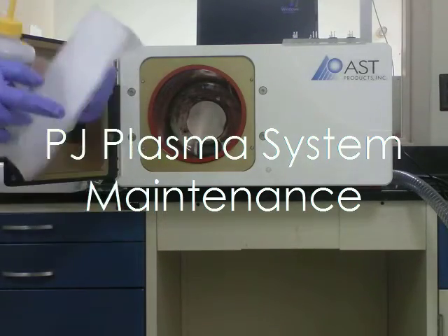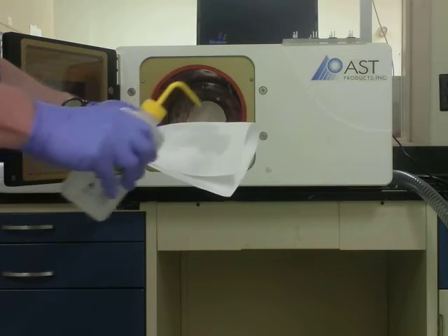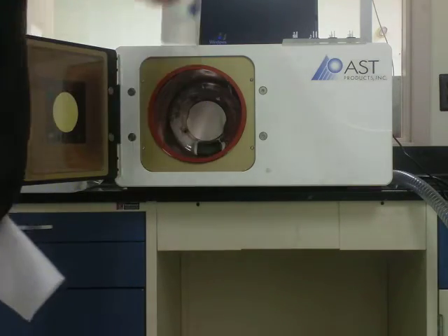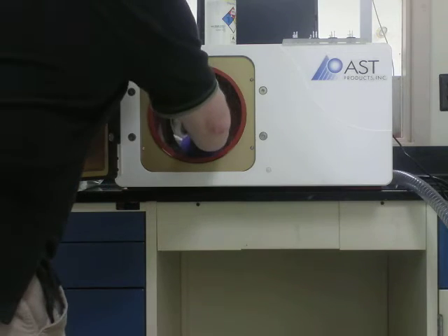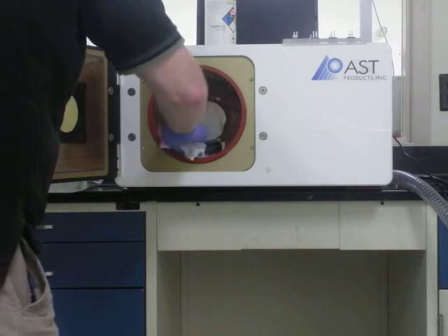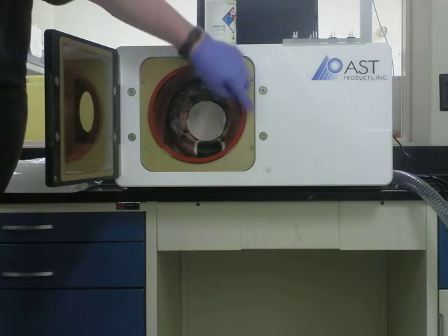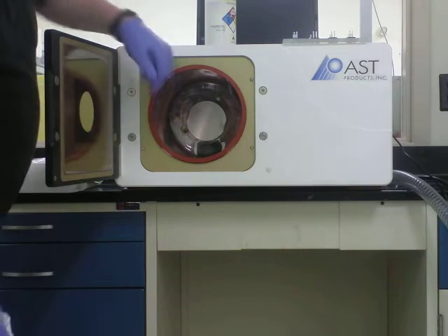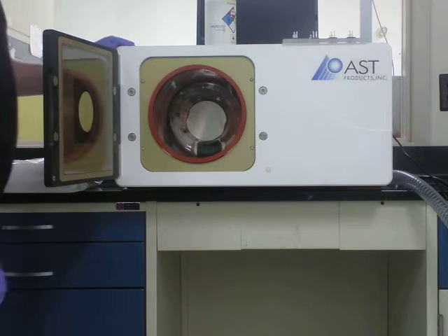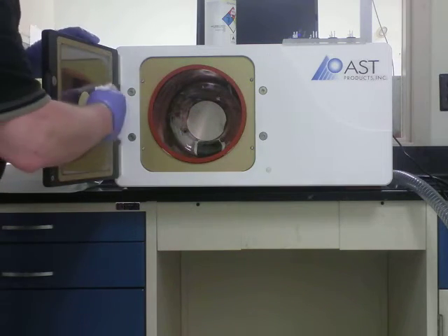AST suggests that each morning you wipe out the interior of the chamber with a clean room cloth like a Texwipe and isopropyl alcohol. While you're there, it's a good idea to inspect the O-ring on the chamber and make sure there are no cuts or cracks in it, and no fibers or anything that will interfere with a good vacuum. Wipe that down as well and wipe off the door.